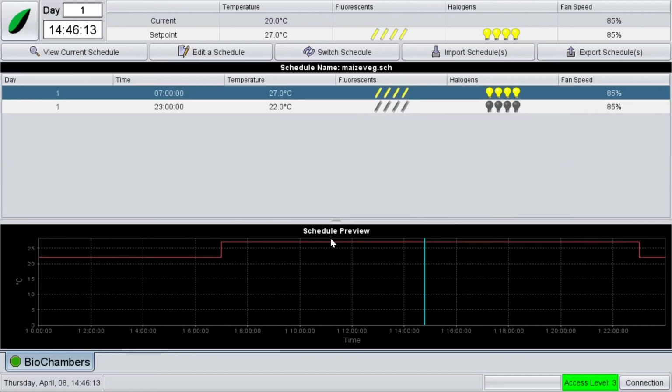And the other thing to note here too, is that if you're a night owl and you like working late at nights, you can set your plant growth chamber schedule to be offset from actual time, and you can have the plant daytime in our nighttime and work that way if you want.